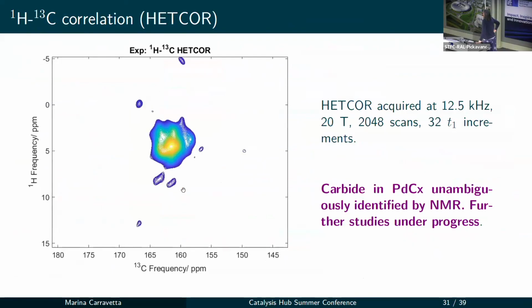Well, at the moment, we don't manage to distinguish very much between the different protons. We have this data, and all these protons, despite being at relatively high field, are not resolved well enough. So it could be that the alumina protons and the protons from water are quite close by.